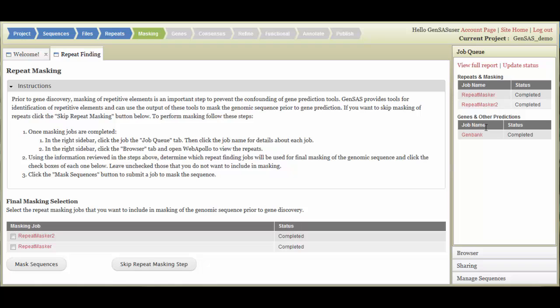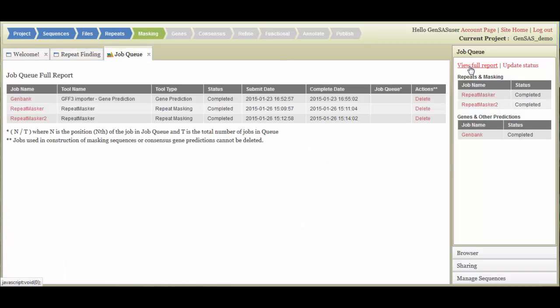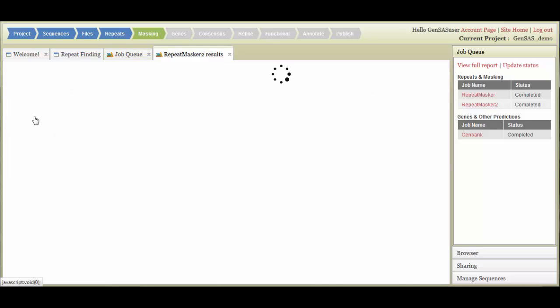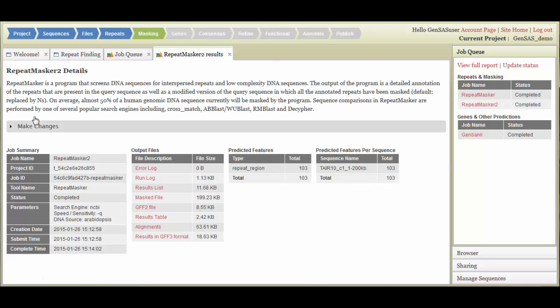On the right side menu, there is an overview of the job queue that tells you the status of your jobs. When you click the View Full Report, a tab will open that has more details about each job including the position in the queue. If you click on the job name in either the menu on the right or the Job Queue tab, it opens another tab that takes you to a summary of that job.